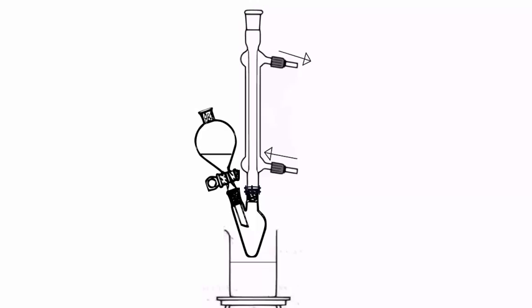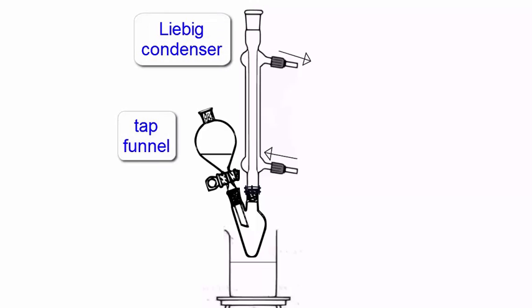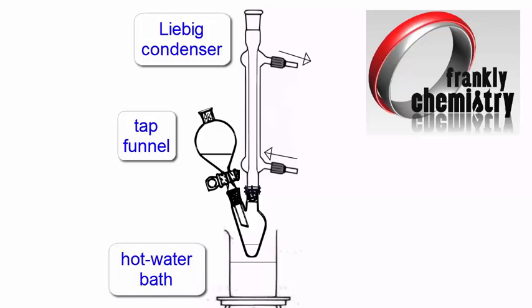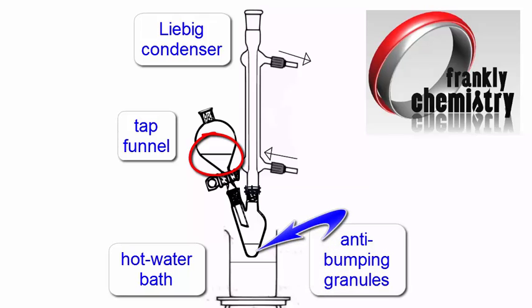You would have your second reactant in the tap funnel. Important also to add anti-bumping granules to the flask to promote smooth boiling. Then you can add your second reactant from the tap funnel, slowly, or in stages throughout the practical.